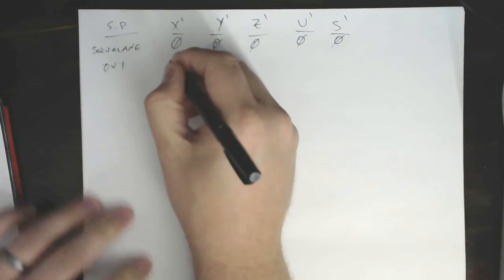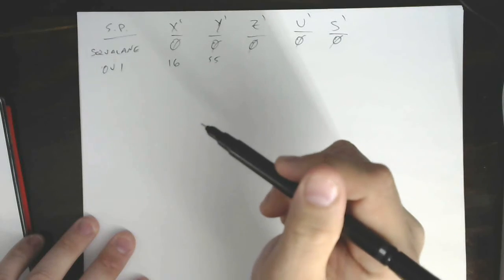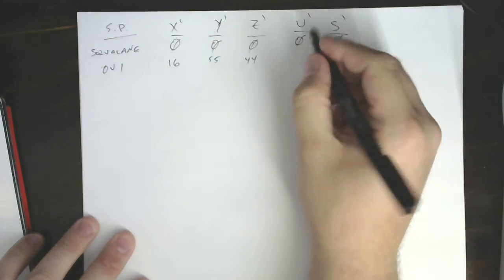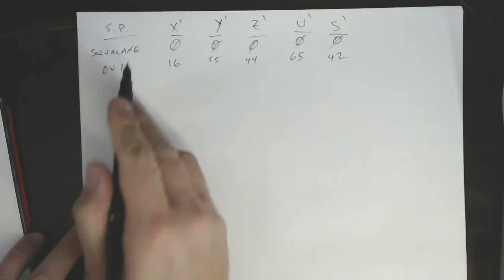Here's some example numbers that we see. This is pulled straight from Supelco. Probably the same thing I'm going to link to in this discussion. 65 and 42. So this was PDMS.